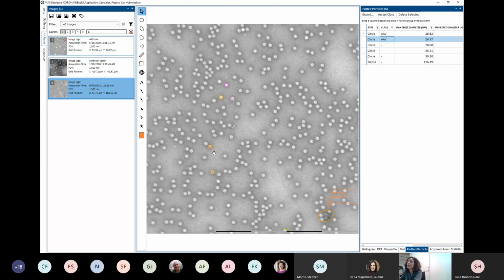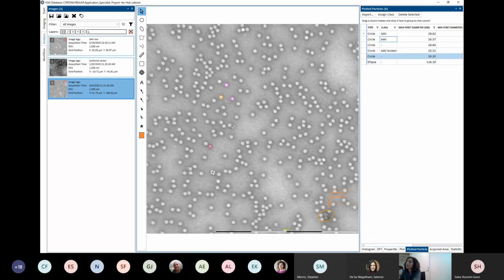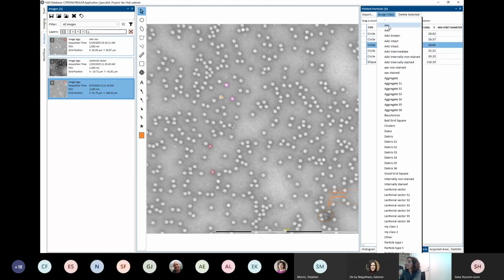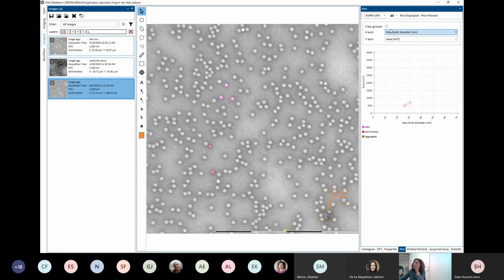This one here, I'm going to assign class. This one is a broken one, and this one was also a broken one. Assign class AAV broken. This one, I thought this was maybe an aggregate. This one I'll just do as an AAV as well. So now when I go back to my plot, I can assign classes for this and have them here so that you can see them in a different way.